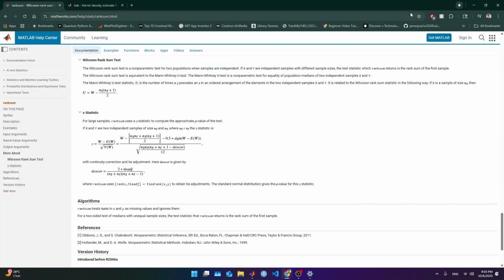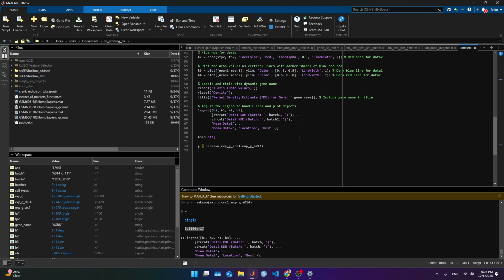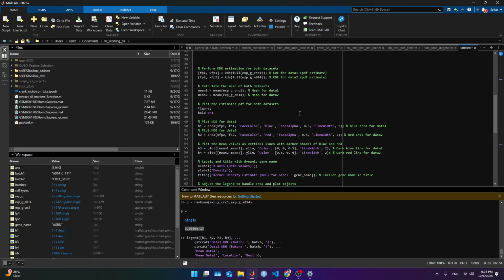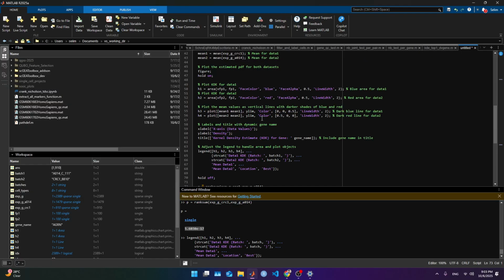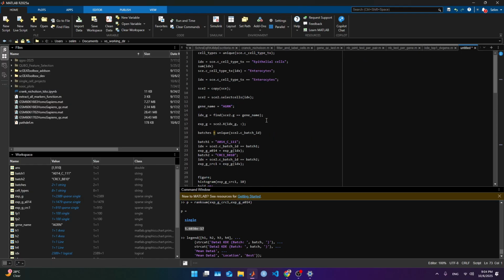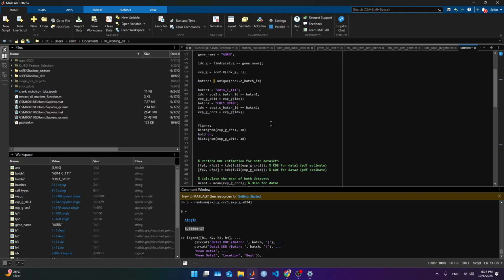And that's it. I think I provided a hands-on work into how the differential expression works, how to visualize every single element, and do the Wilcoxon by hand. Now, all this is done in the code automatically for all the genes. We don't have to code it by hand, but this is just to know and be aware how that is happening in the back end.